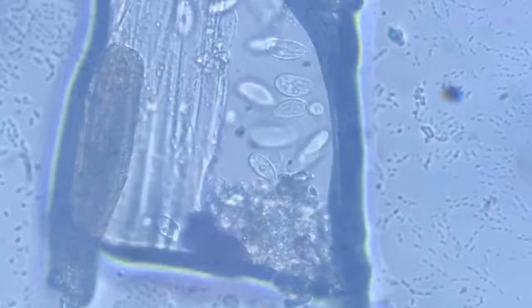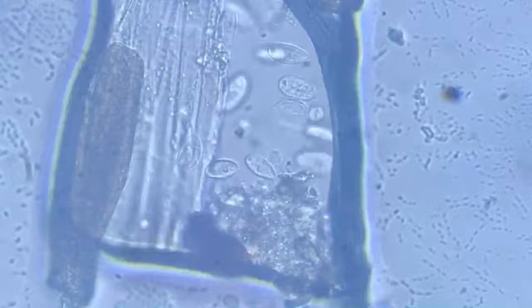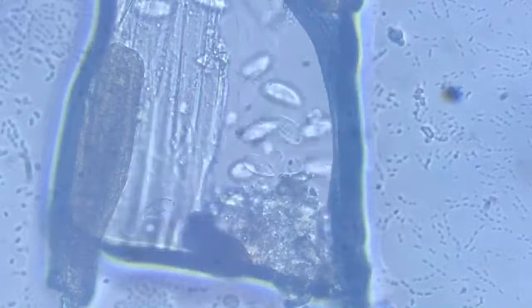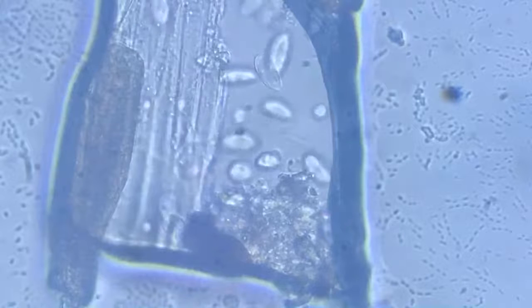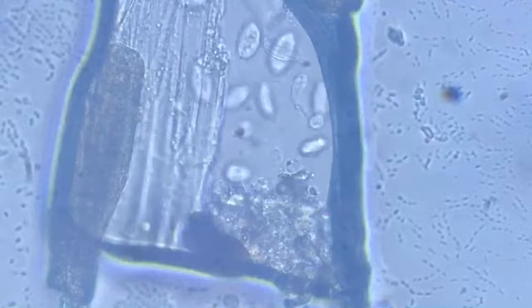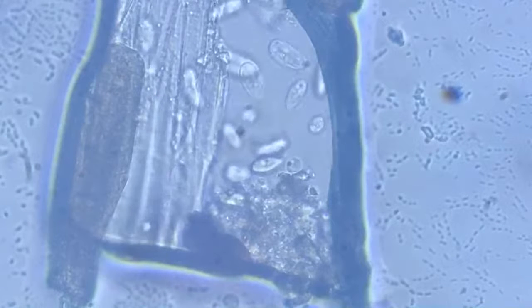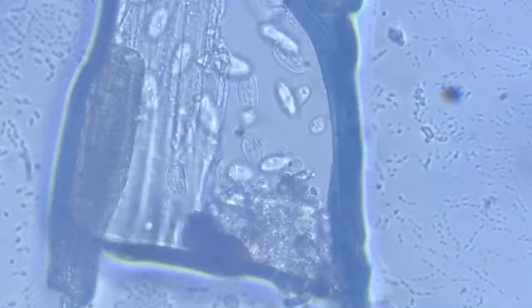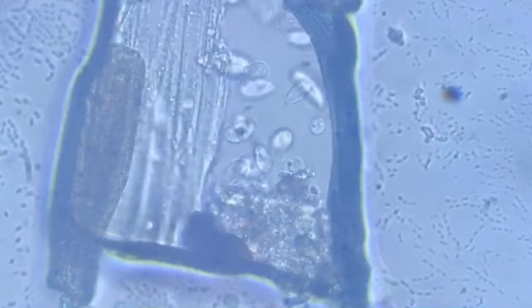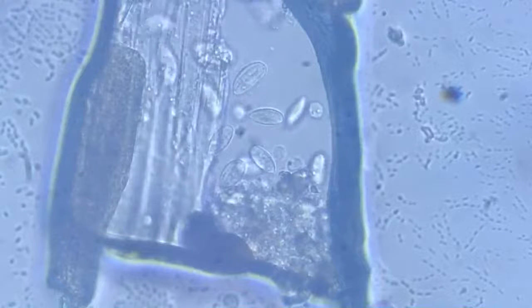You see a lot of bacteria in the background, those little black dots, small dashes. They are all bacteria. And these euglenids have understood that the time is running out for them. You can see the air bubble slowly shrinking. Rather, the air bubble is increasing and the water is shrinking.